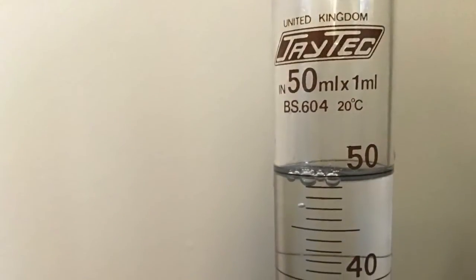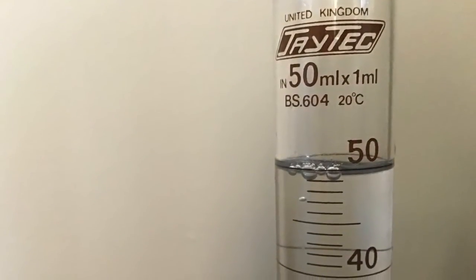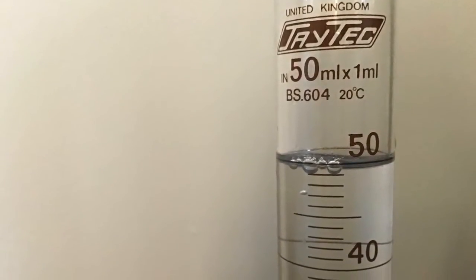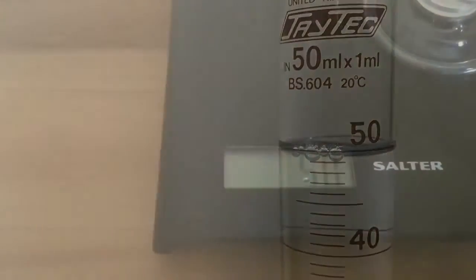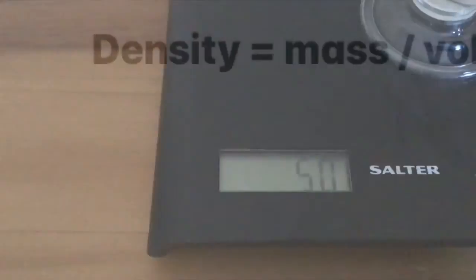So we pour it carefully into the measuring cylinder to get 50 centimeters cubed. Looking closer at the measuring cylinder to check, you can see it's exactly 50 centimeters cubed and 50 grams on the scales.